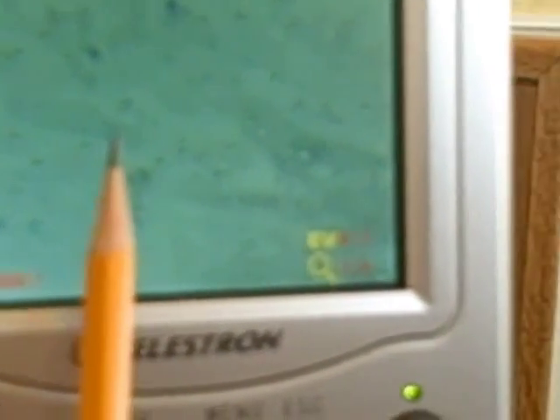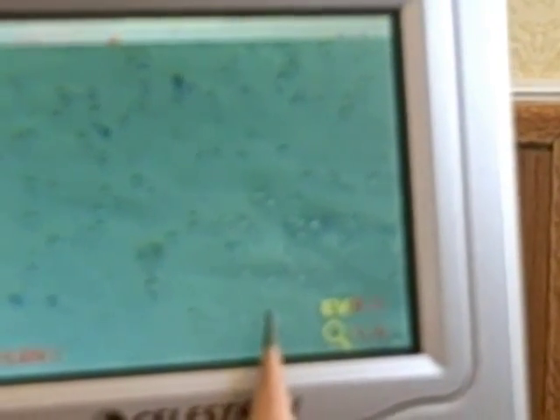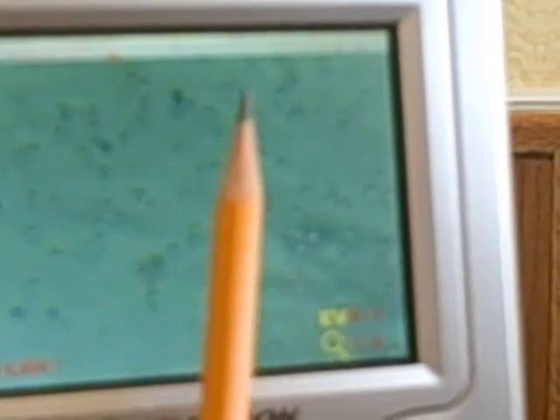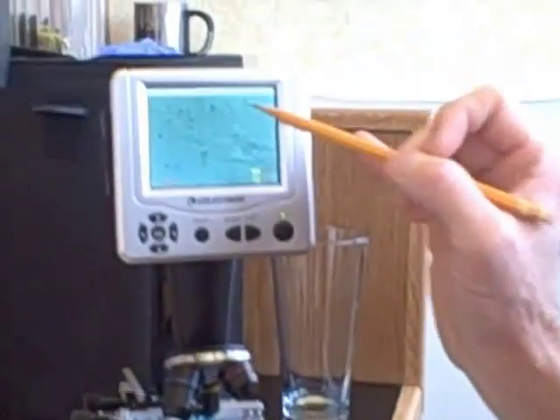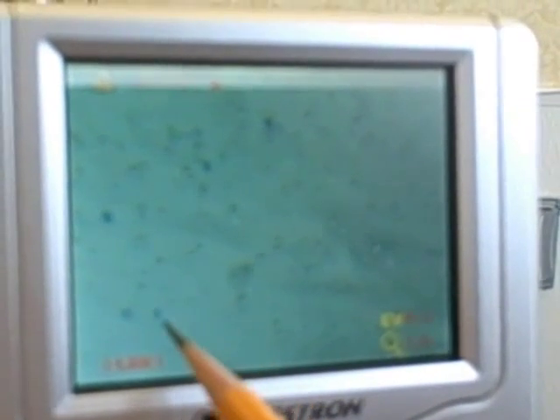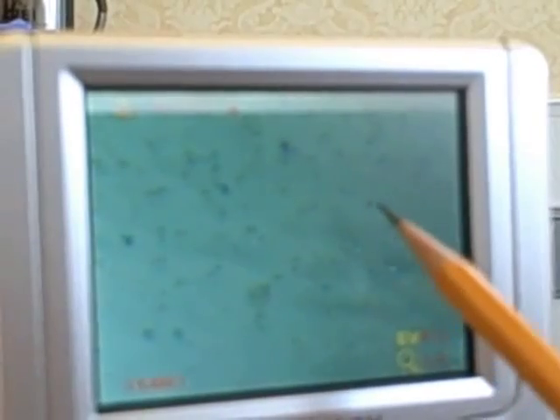Hard to count a big mass like that. Okay, so I got 80. I'm going to write down right here in the corner of my pad: 80. Now I'm going to go back and count how many of these were blue in here. I'm going to have to adjust this a little bit. That is one, two, three. Within this grid, I'm getting three. So I'm going to write three.